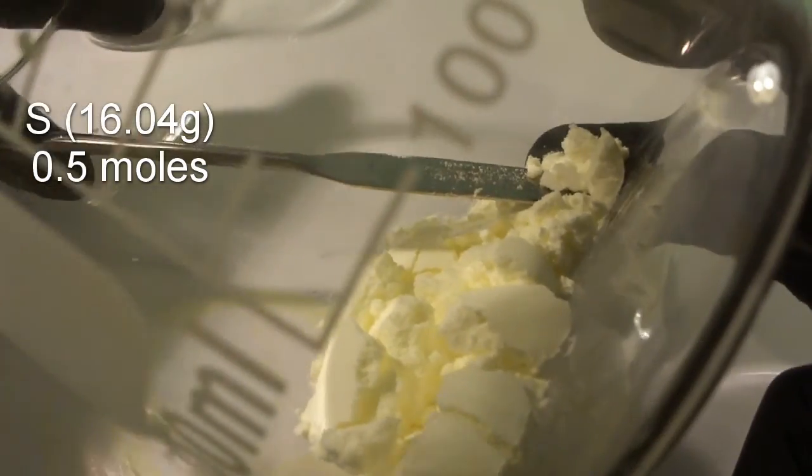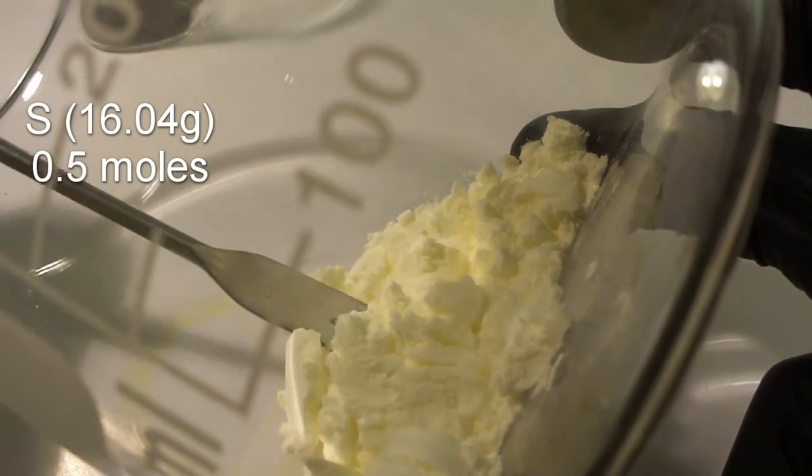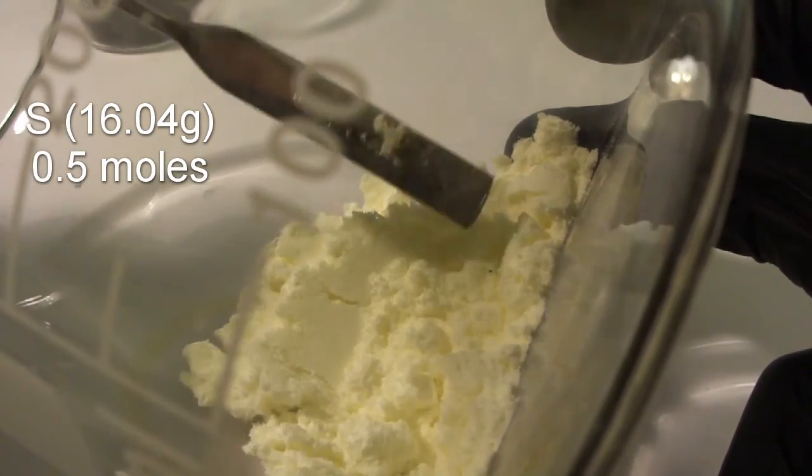Next, measure out 16.04 grams of flowers of sulfur. It is a yellowish, odorless powder. We've got some lumps in there but nothing serious.